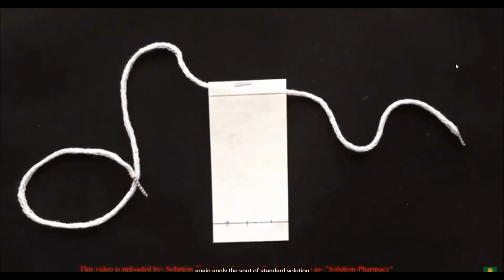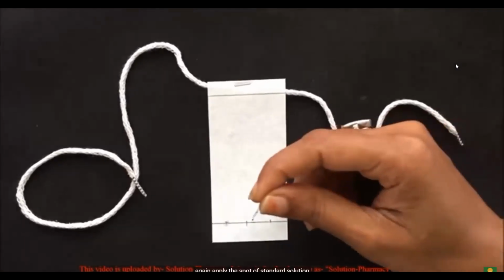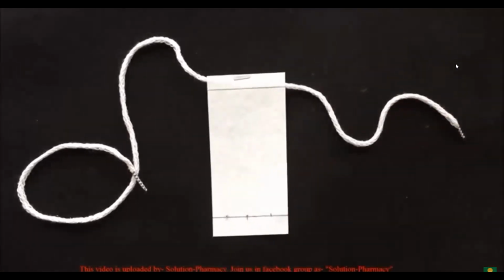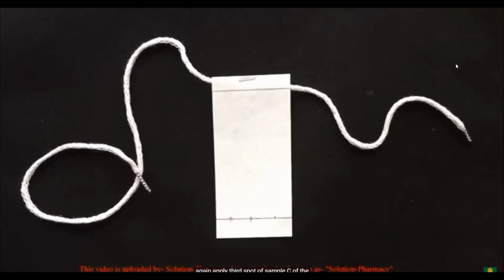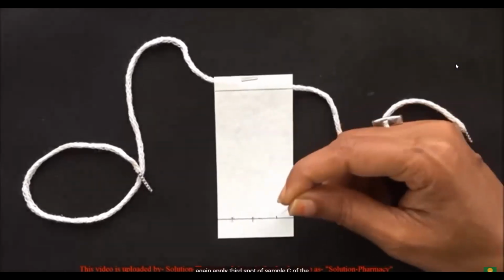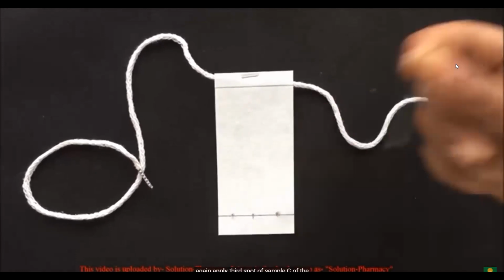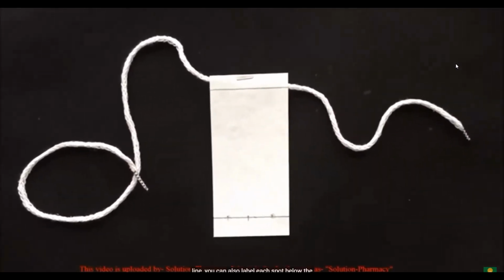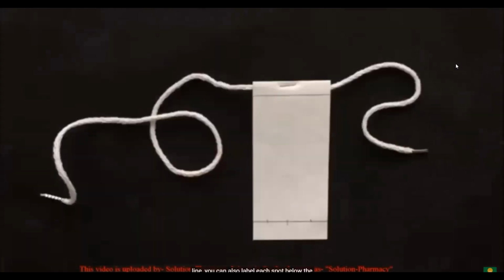Again apply the spot of standard solution B in the similar way on the mark point on the starting line using another capillary tube. Again apply the third spot of sample mixture solution of amino acid on the third mark point of the starting line. You can also label each spot below the starting line for its identification. We have stapled a thread on the top of the filter paper to hold and support the filter paper in the upright position at the center of the beaker at the time of development.